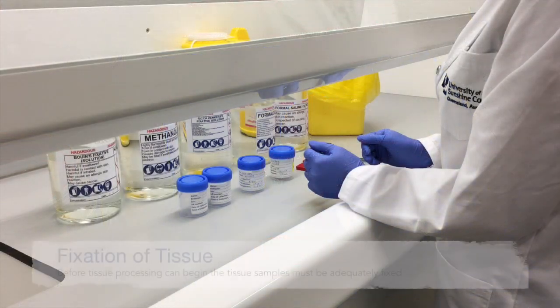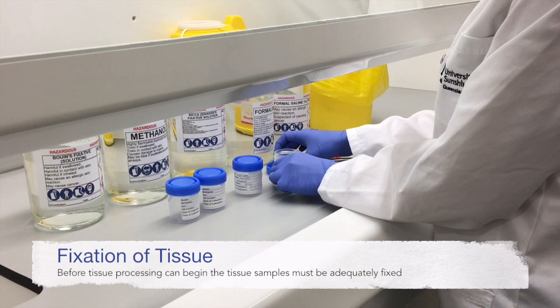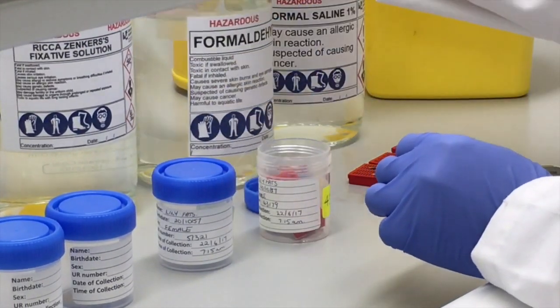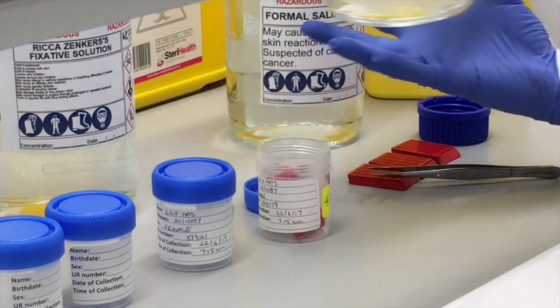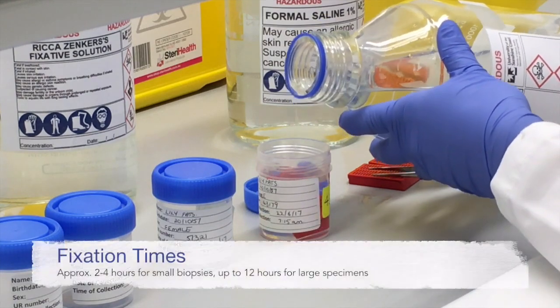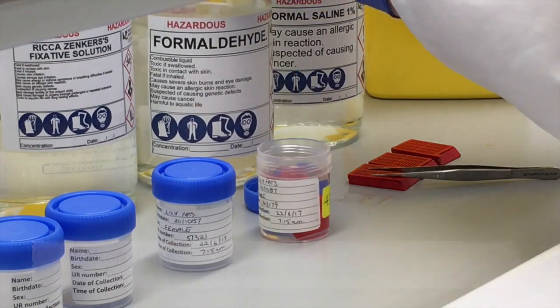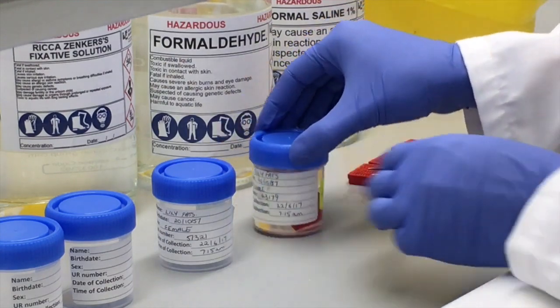The purpose of fixation is to preserve the tissues permanently in as lifelike a state as possible. Fixation should occur as soon as possible after the tissue has been removed from the body, and this usually occurs in the operating theatre, but sometimes occurs in the lab. Fixation reduces autolysis, otherwise known as tissue degradation. There are a variety of fixatives that can be used, depending on the type of tissue present and the features to be demonstrated. The routinely used fixative is an aldehyde called formalin, otherwise called formaldehyde.